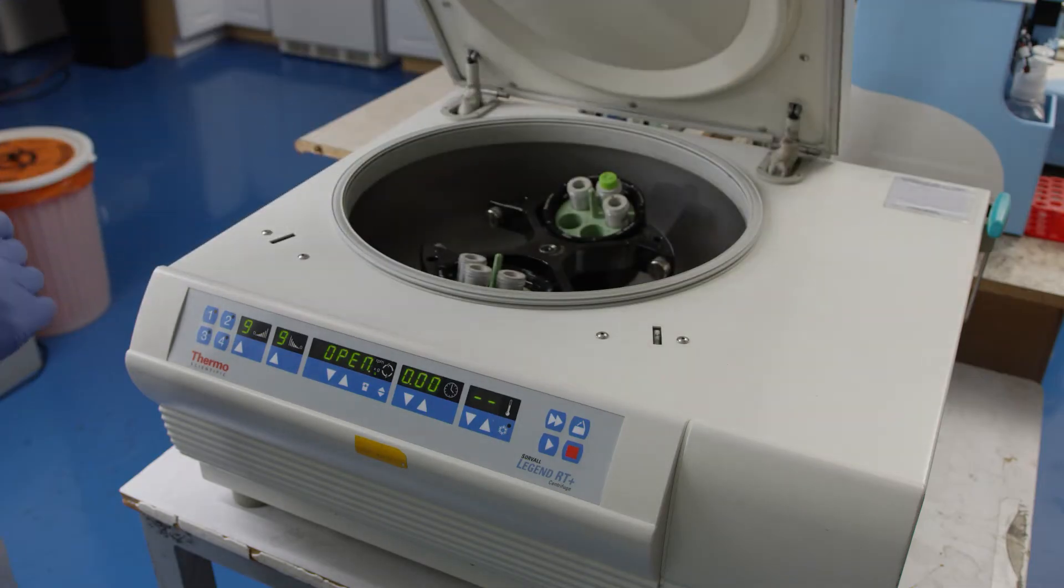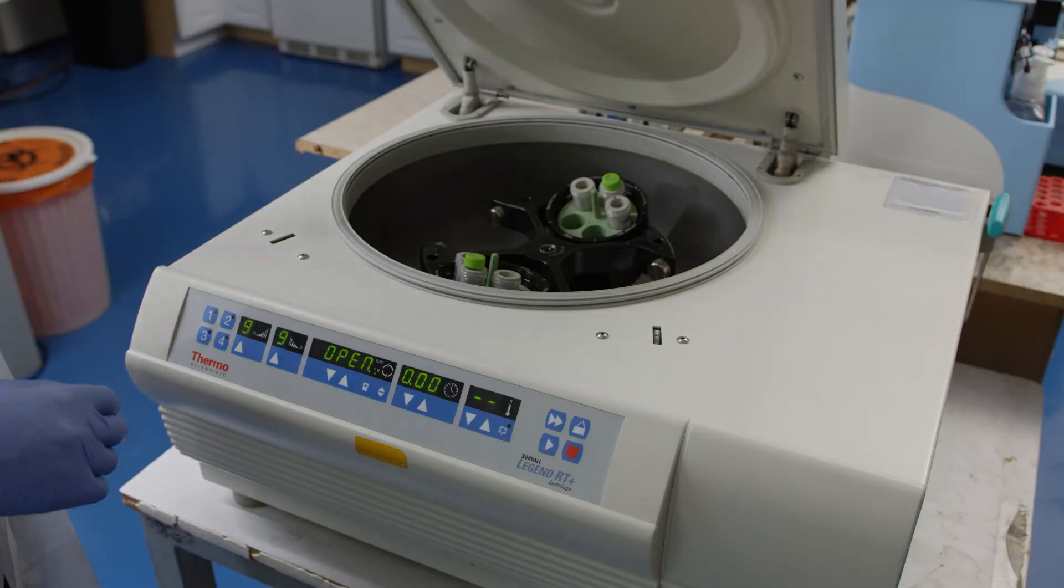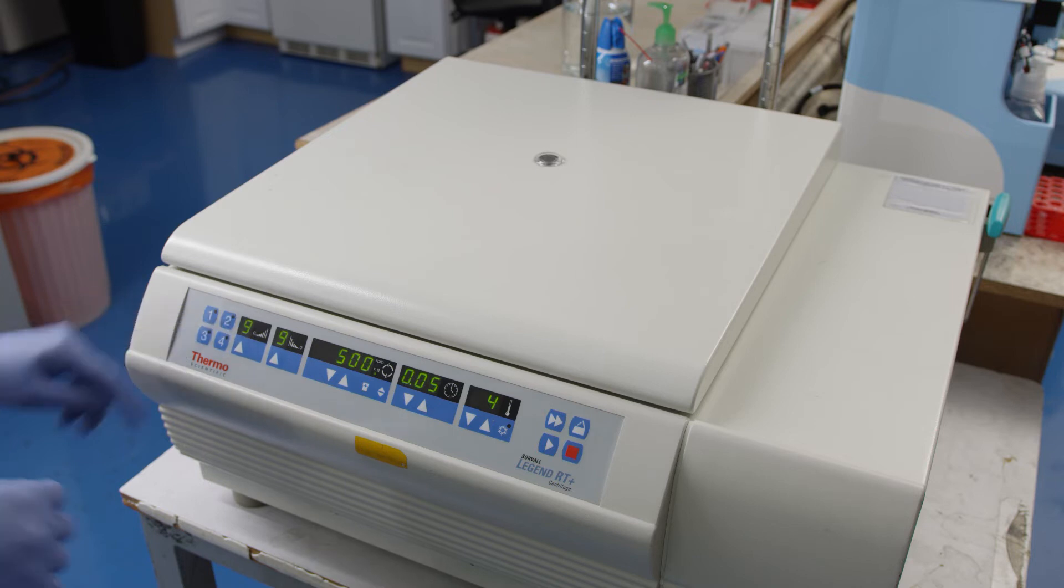After transferring the nuclei suspension to a conical tube, centrifuge the tube for 5 minutes at 500 g and 4 degrees, or at a speed appropriate for your particular tissue.